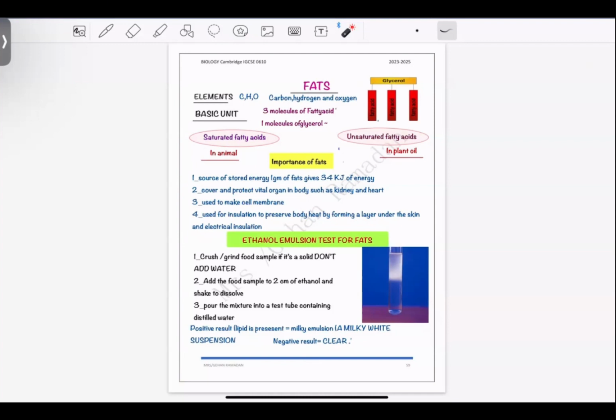By the way, also in starch, sometimes when we test for starch, we can use the sample as it is. We can test starch on a piece of potato or a piece of onion, without grinding them or making them powder or adding water or anything. This is the only test we can make like this.